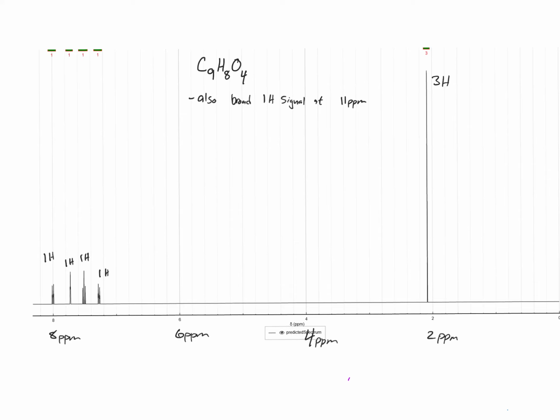Here is another NMR structure determination problem. I will show you all the data, and then you should pause the video and attempt a solution on your own, and then press play and you can watch my proposed solution.